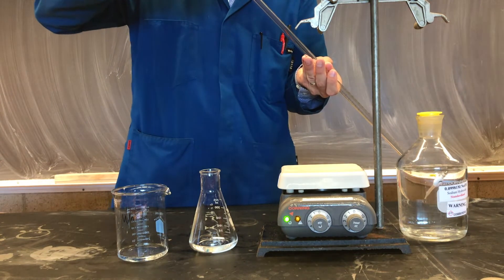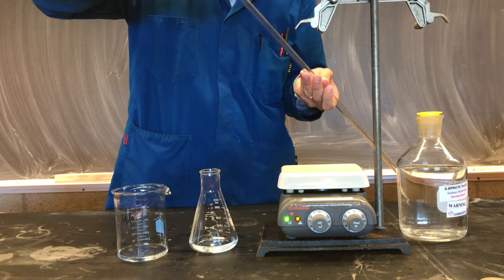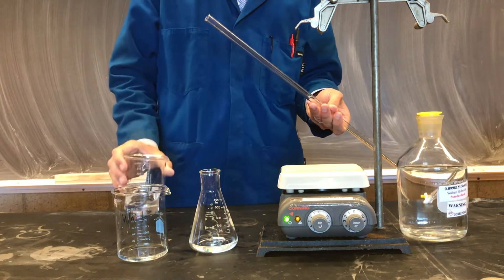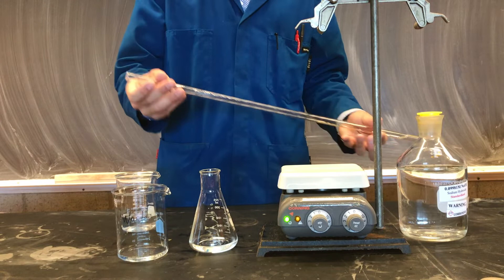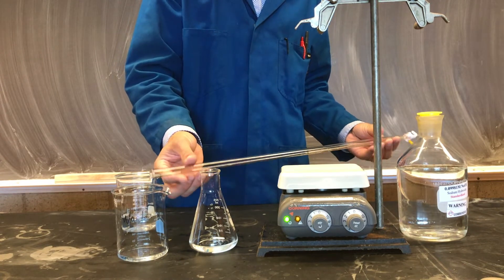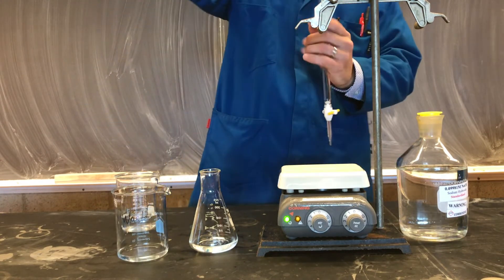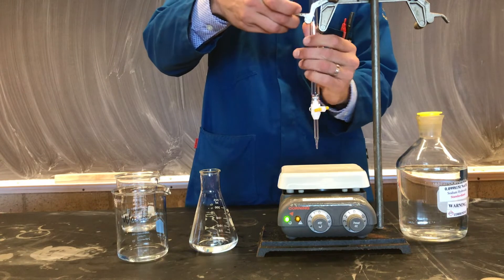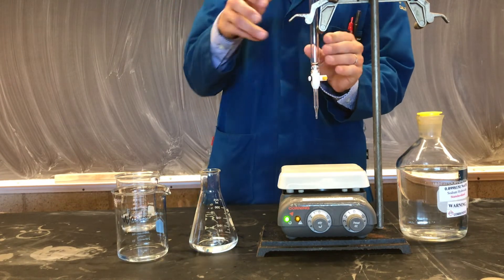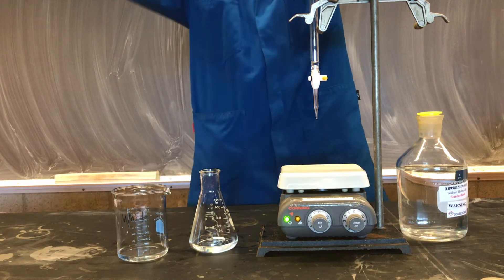We'll put a small amount of our titrant in our burette. We'll then roll the glassware to ensure the entire inside of our burette is coated with our solution, and return it to the burette clamp. Then, using a funnel, we can fill our burette with our titrant.